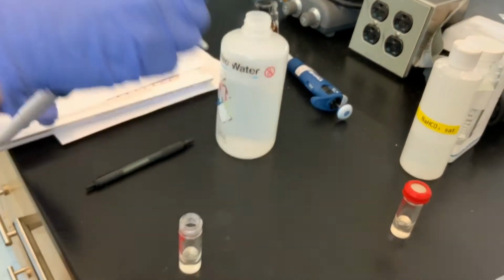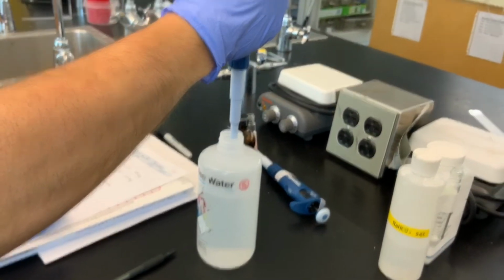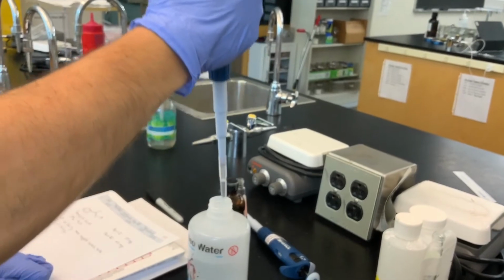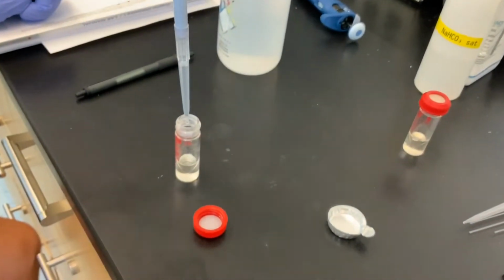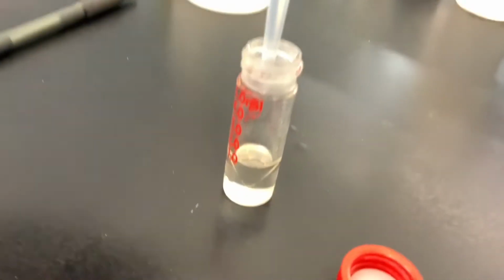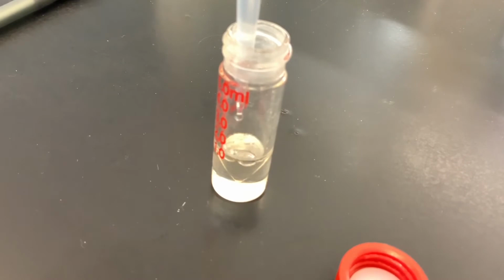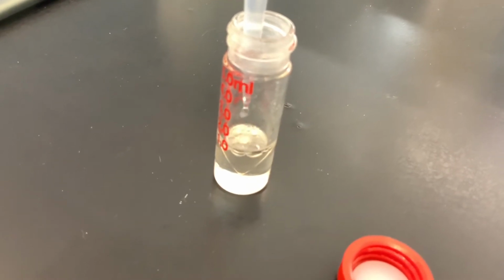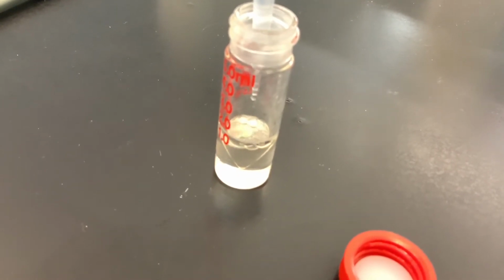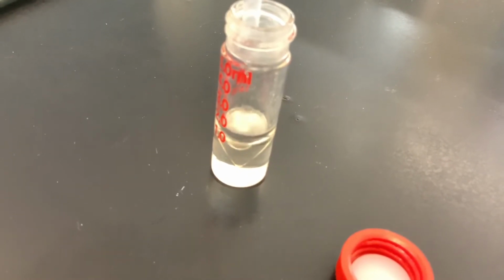So I need 600 microliters now of distilled water. And just go ahead and watch very closely that as I add the water, you see that it's forming bubbles of its layer on top of the methylene chloride.